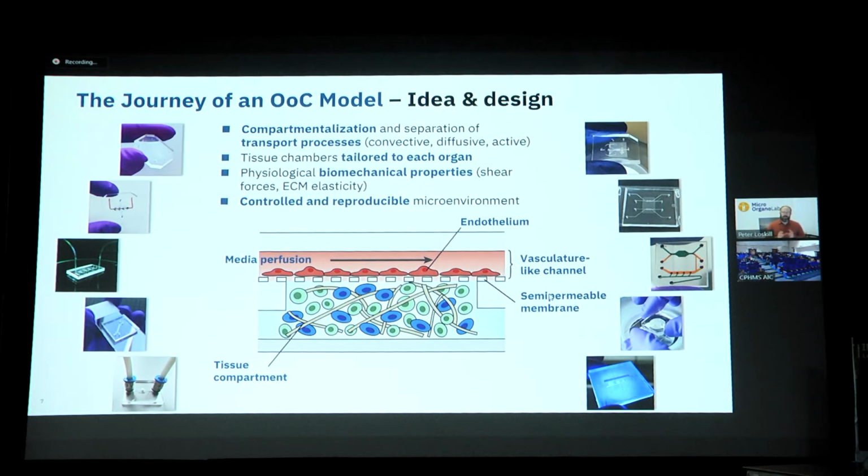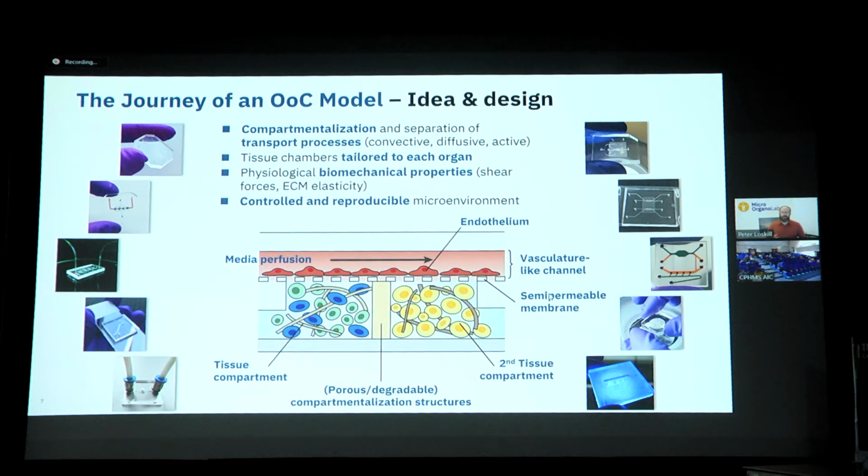Then we have tissue chambers, which are tailored to each organ and which have physiological biomechanical properties, but also give a controlled and reproducible microenvironment. These can be individual tissue compartments, but it can also be multiple tissue compartments separated by different types of structures. So that's the underlying idea.